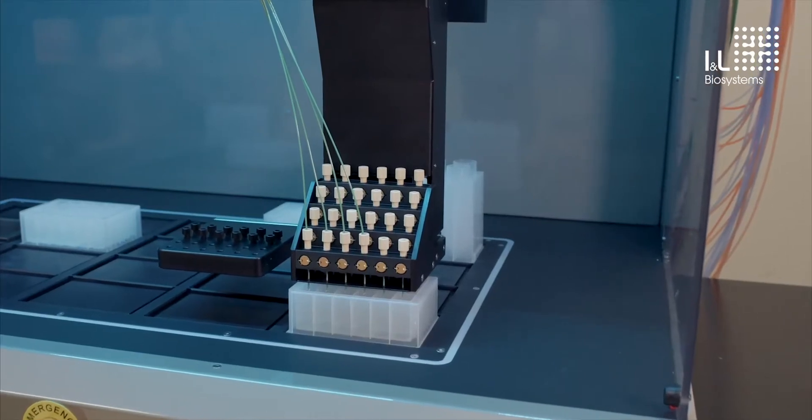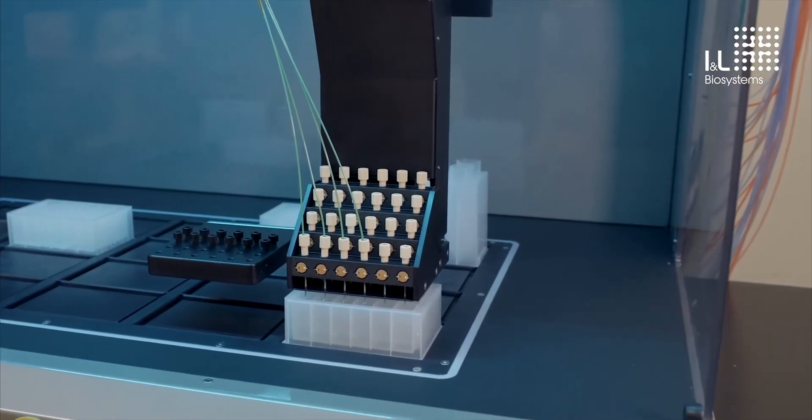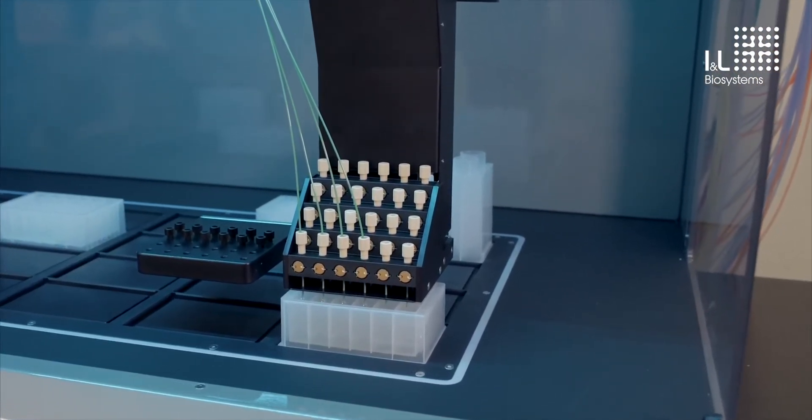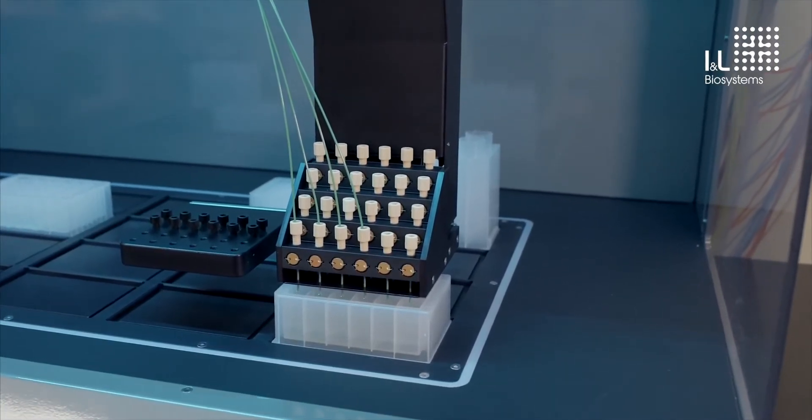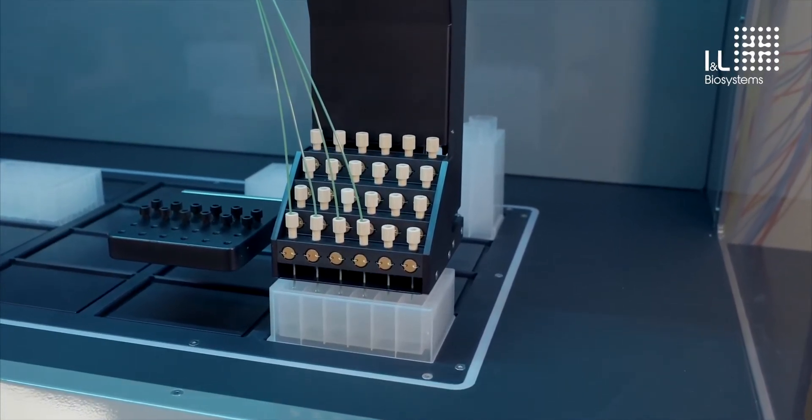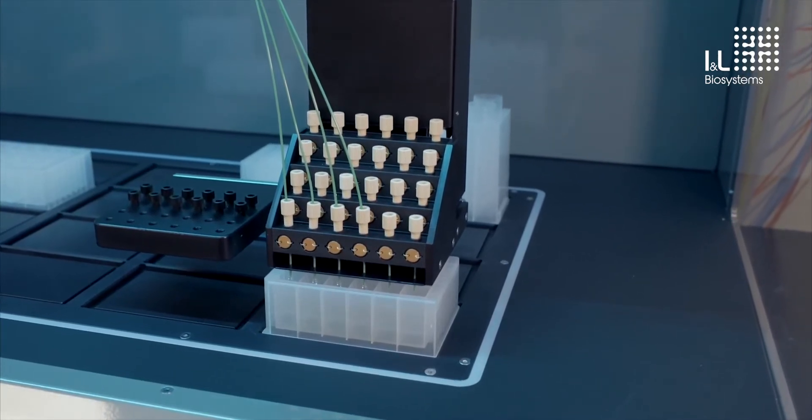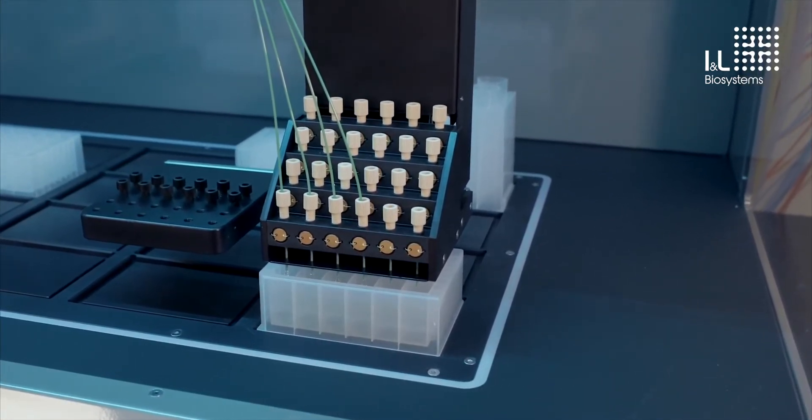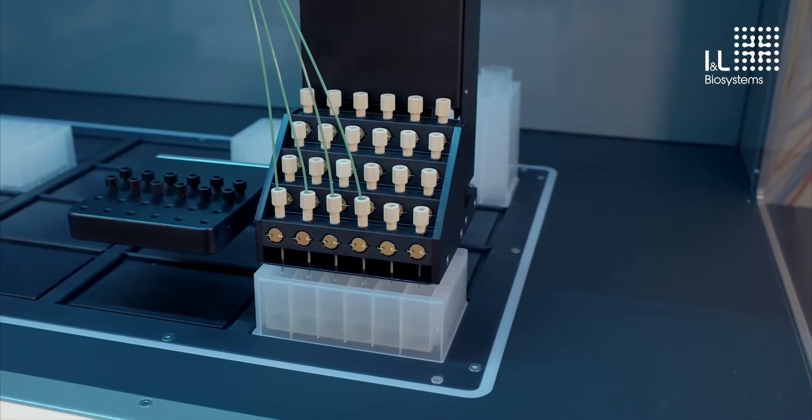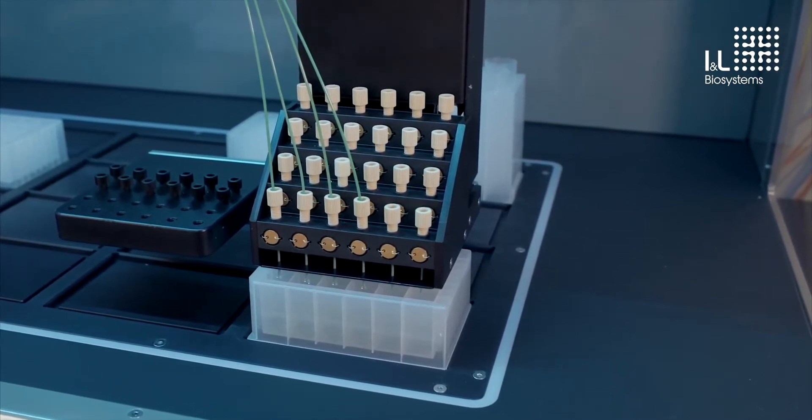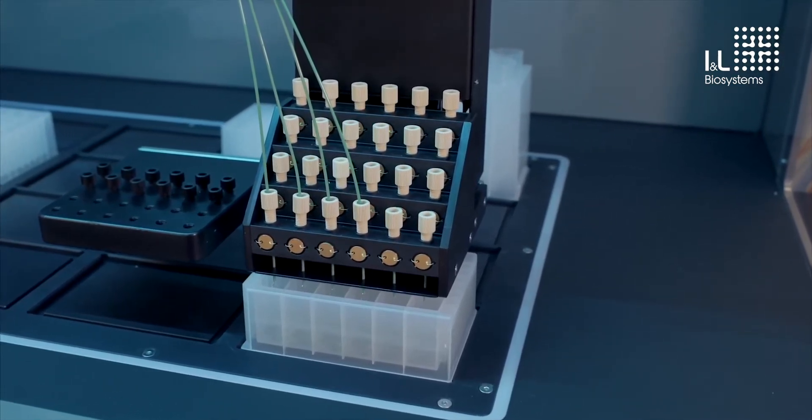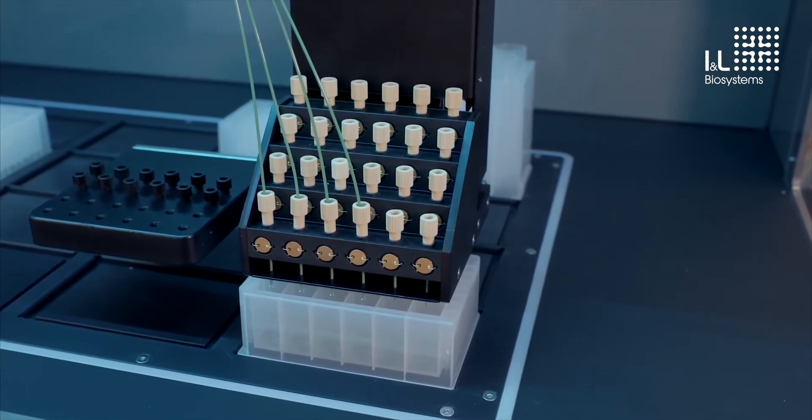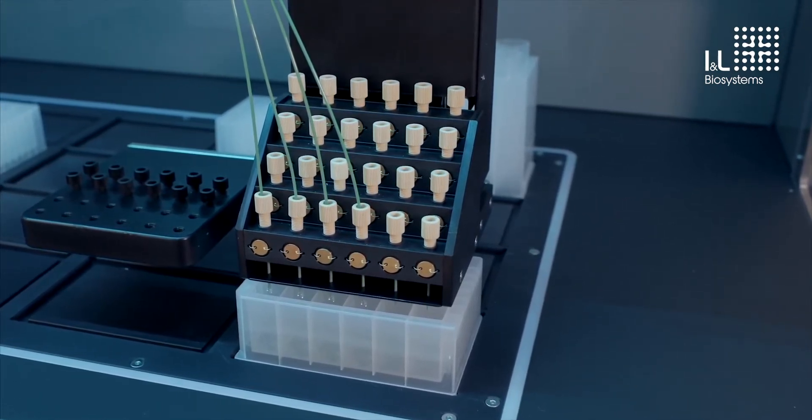Now, the Protein Maker is not just a liquid handler. It is a dedicated purification system equipped with UV monitoring as an optional upgrade. The UV system is seen here attached to the robotic arm. The gold circles that you're seeing are the UV detectors. Just behind the detectors are the flow cells, and just behind the flow cells are the UV light sources. There are 24 independent light sources and detectors, enabling live monitoring of all 24 lines.